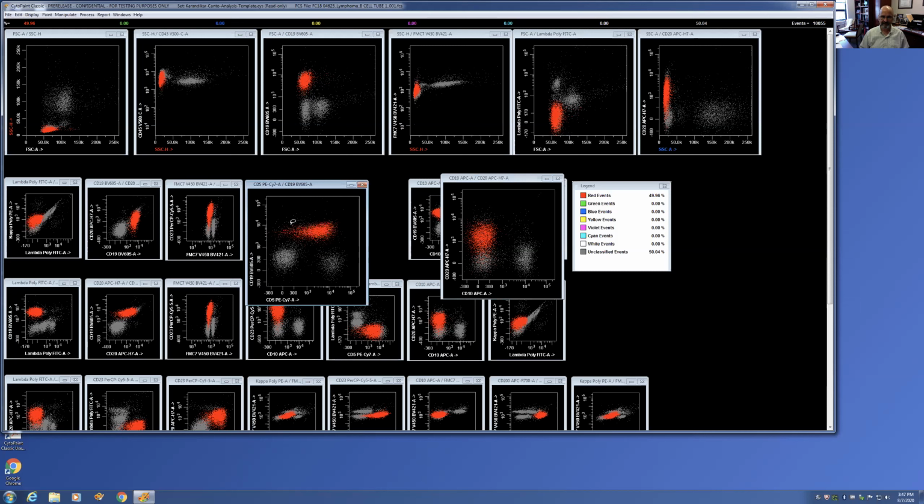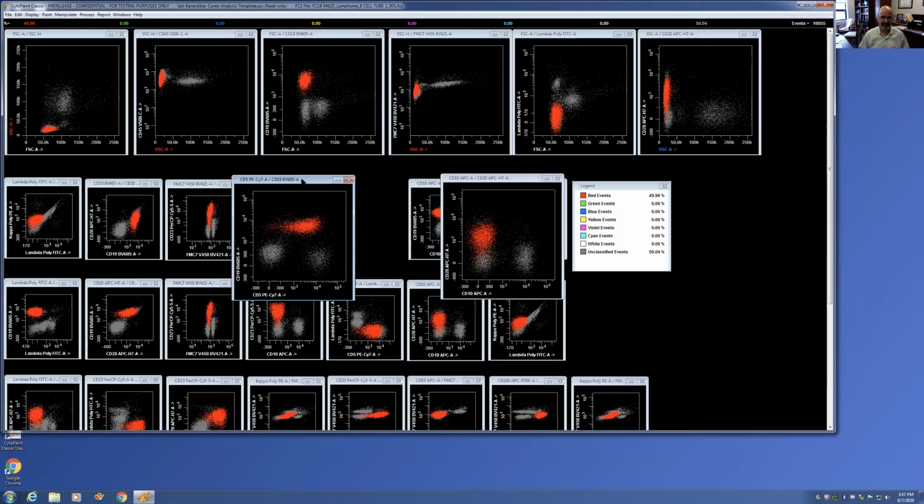So regular B cells would lie right here. This clearly stretching out into the CD5 positive zone, almost as bright, some of them, as the mean brightness of these T cells. Just so you know, these are T cells, see nice lymphocyte cluster, CD5 positive. T cells tend to be slightly brighter for CD45 than B cells. I'm just sort of rattling off things randomly as they come to my mind.